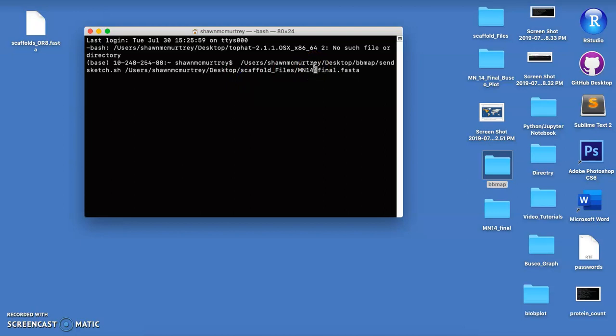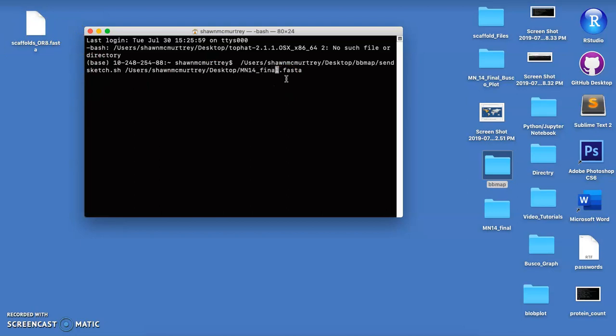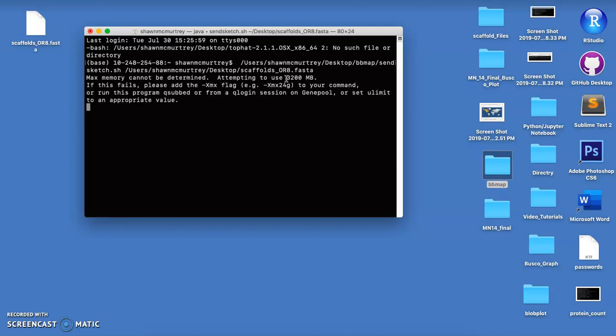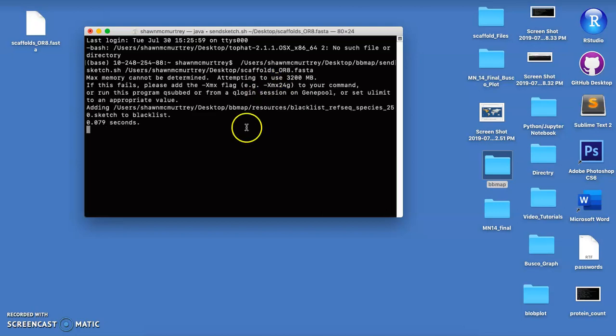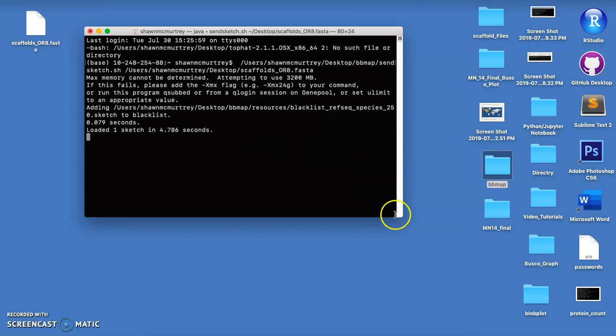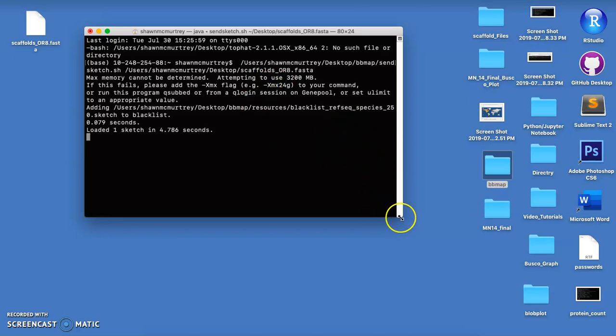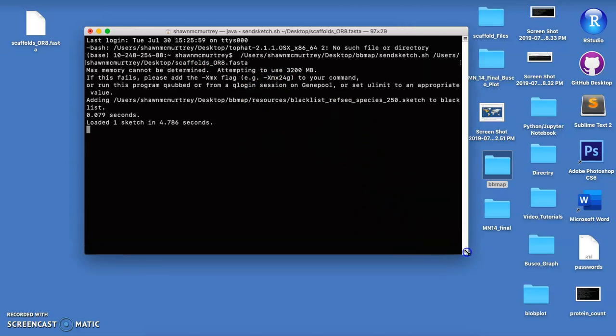We just have to change this up here, so we're going to run our scaffolds_OR8 FASTA file. And it's also a nice thing about this program, runs really quickly within a few seconds.